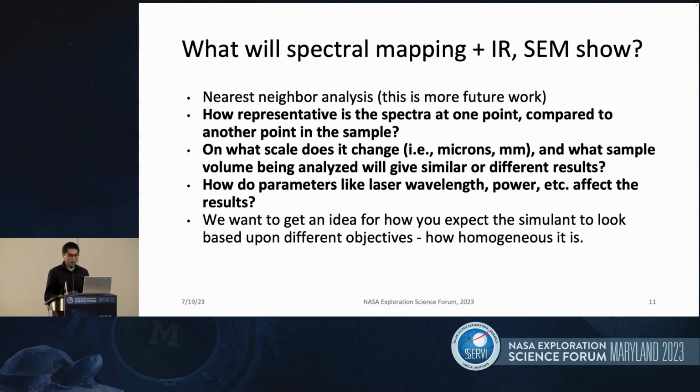With our FTIR instrument that we have in our lab, we plan to take complementary IR spectra and process for atmospheric and water interactions that occur in the mid-IR. And as for the SEM, we plan to use the Zeiss SEM instrument that we have on campus to provide extremely high quality images of the surface structure of these samples.